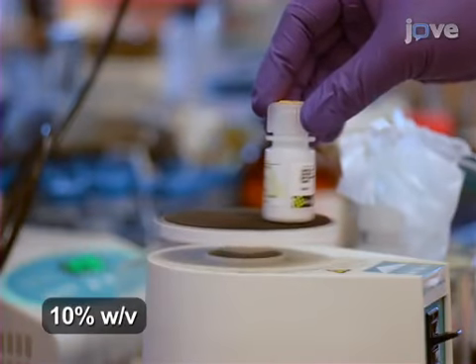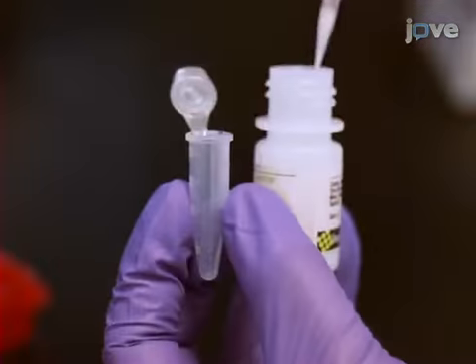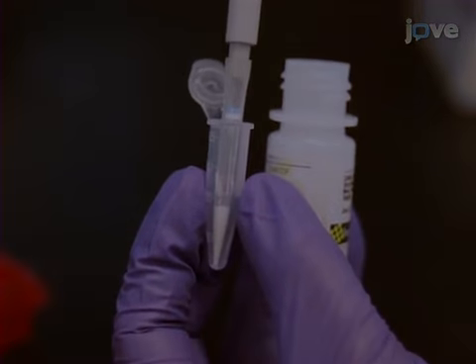Vortex the microsphere suspension, and then transfer 60 microliters to a 1.5 milliliter microcentrifuge tube.